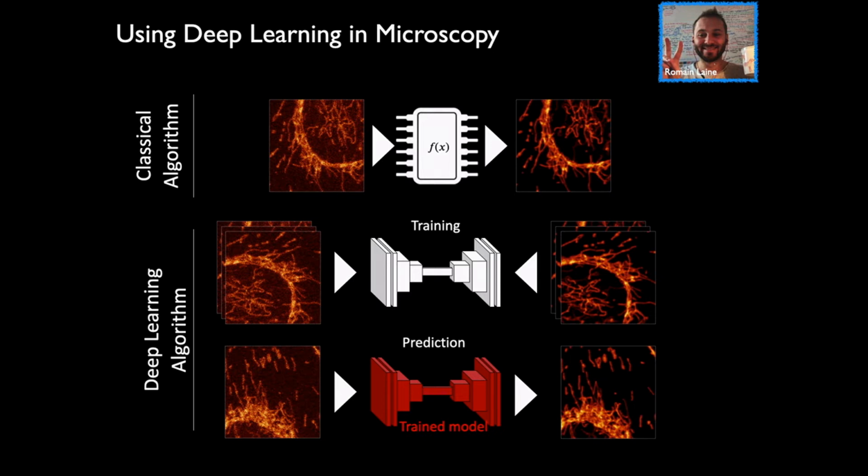So it's not task-dependent, it's training-dependent. And that's really beautiful. It has its downside because the training data really needs to encapsulate any future data that you want to present it. But it's really amazing in that perspective, right?